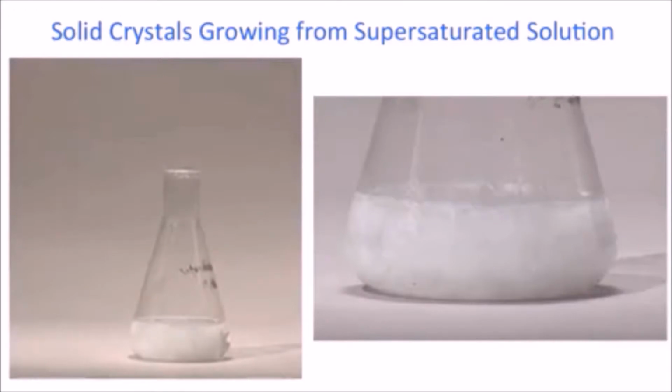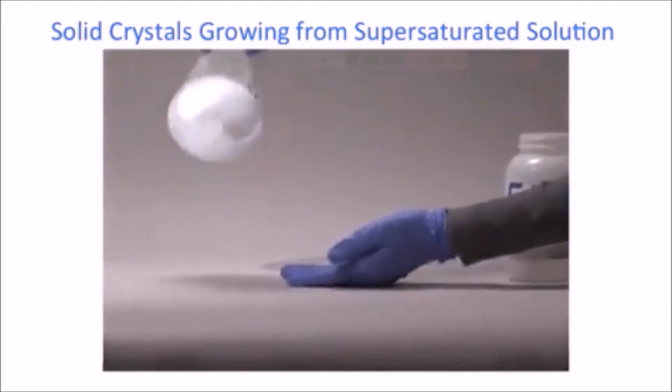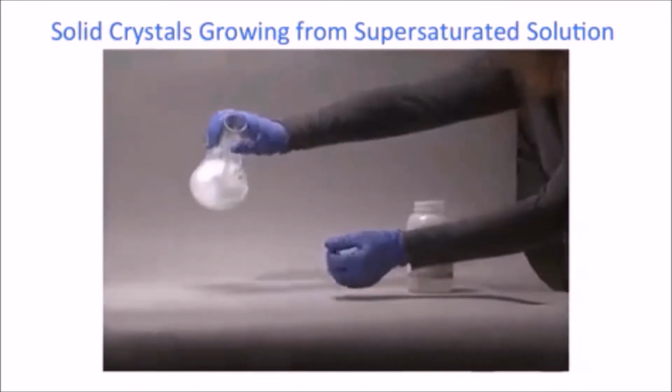Now we can see that the solution which was in liquid state is totally converted to a solid mass. Now the whole flask is completely solid. That is, when we invert the flask, nothing falls down.